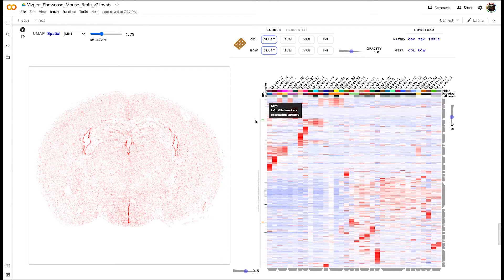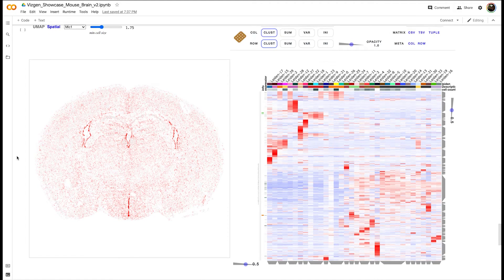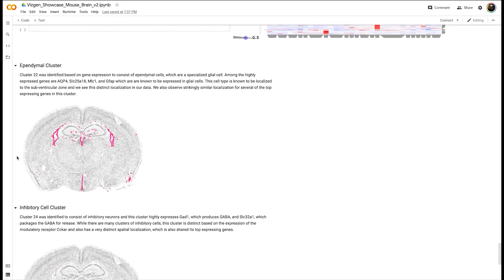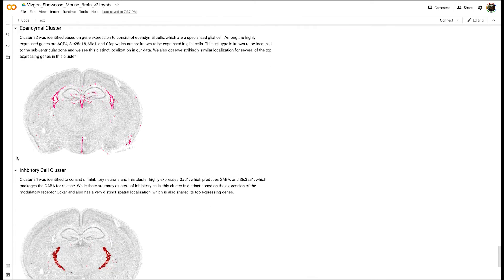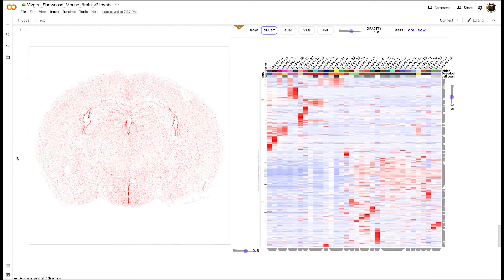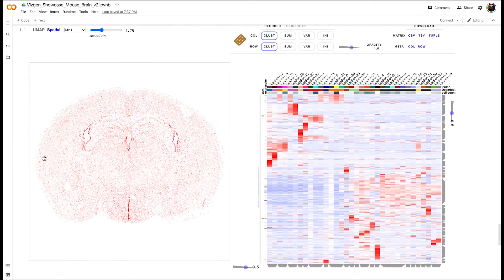Down here we walk through a couple clusters that are particularly interesting and we will quickly walk through those now.